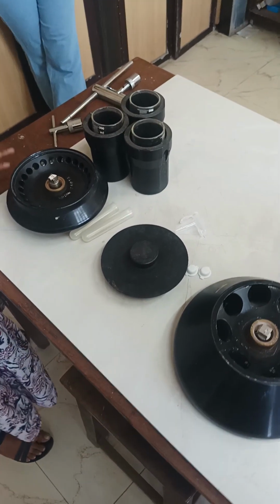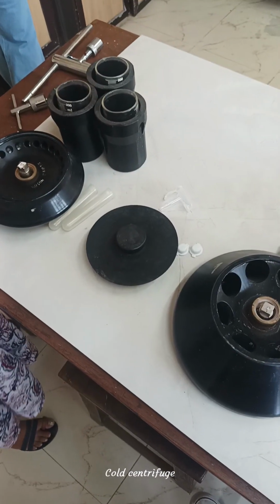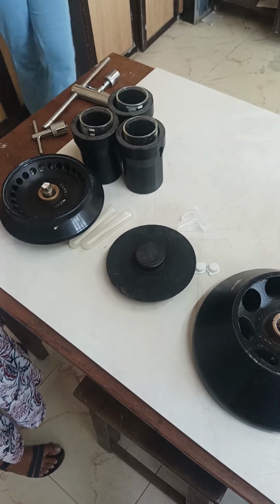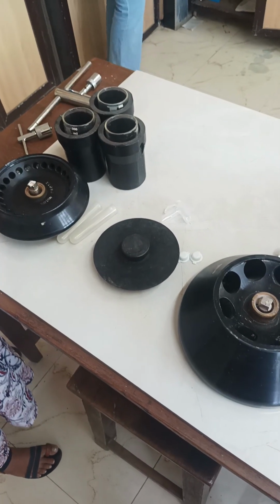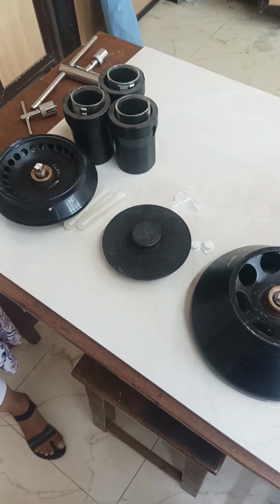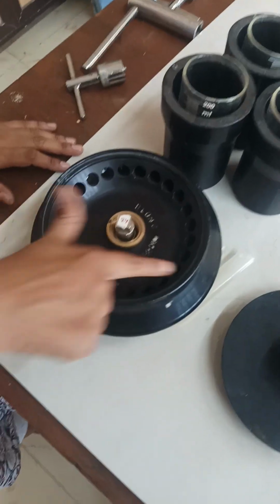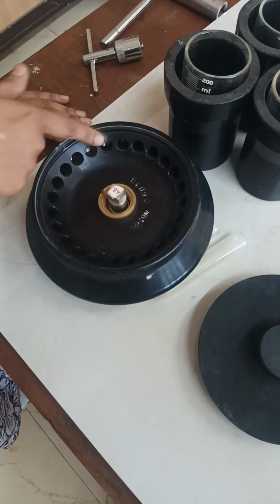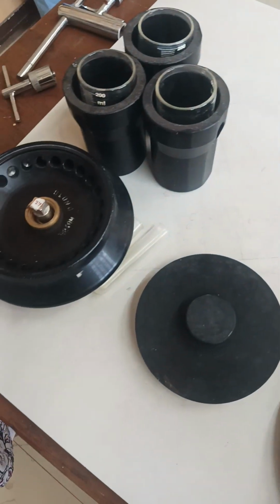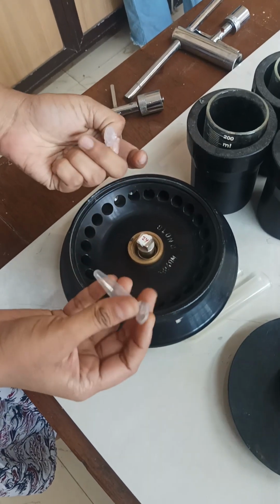Now we are going to talk about the cold centrifuge. Suppose you are working on a protein or a molecule which is temperature sensitive, then you have to use a cold centrifuge. So today we will be talking about the cold centrifuge. Here you can see a rotor with a capacity of 24 Eppendorf tubes. The tubes which go into it are simple Eppendorf tubes of 1.5 ml capacity.